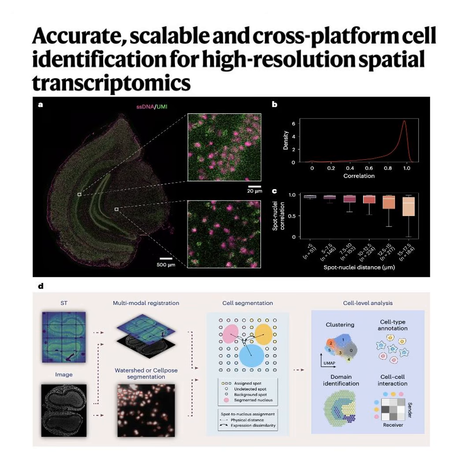Or sweeping in RNA that actually just drifted over from a neighbor. Exactly. And on top of that, running a heavy neural network on a massive tissue sample requires staggering amounts of memory and runtime.